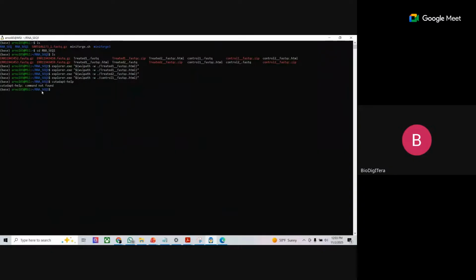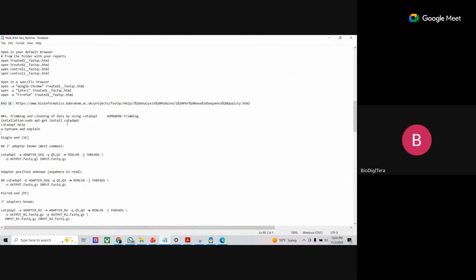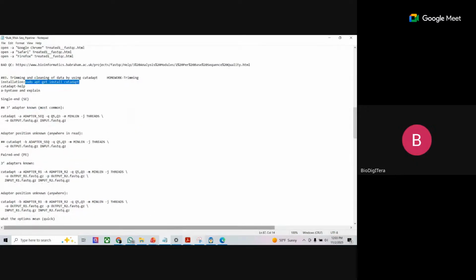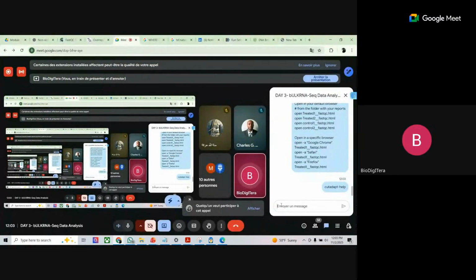It said, no, I have to say sudo. No. Anyway, command not found. It means that I don't have Cutadapt at all. What should I do? I come here. I have to install it. No, I copy it first. I send it to you guys and we run the command together.